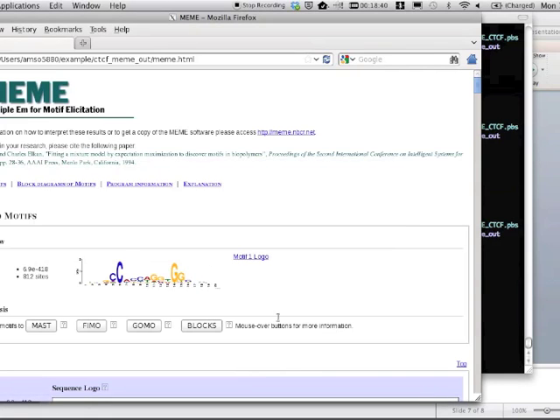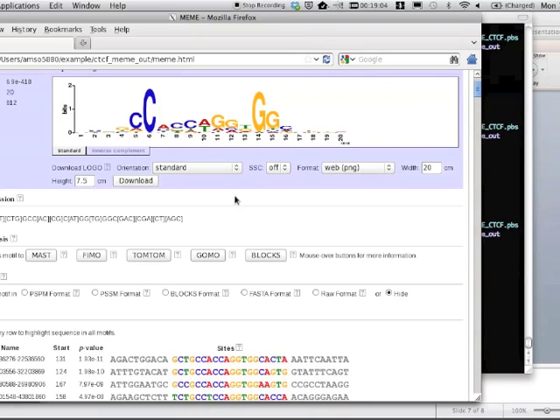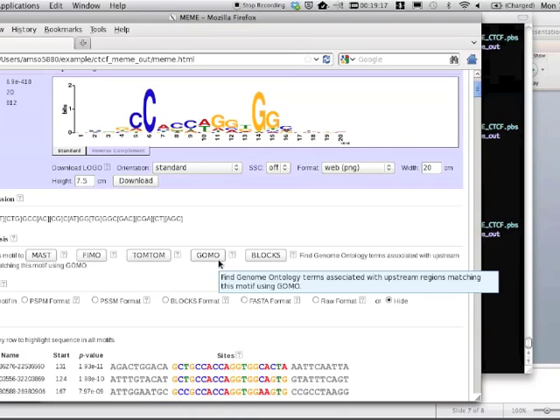Okay, so here it's going to list the motif it found. Of all the sites that we put into it, this is the p-value, or I believe this is the p-value, so it's not corrected for number of tests, like a q-value would be. And this value here is the number of sites. So of all the sites that we gave it, 812 contained that motif. And if we scroll down, it lists its width of 20. So you can, on your own computer, not through the wikis, click on these and do further analysis with the information you gave it.